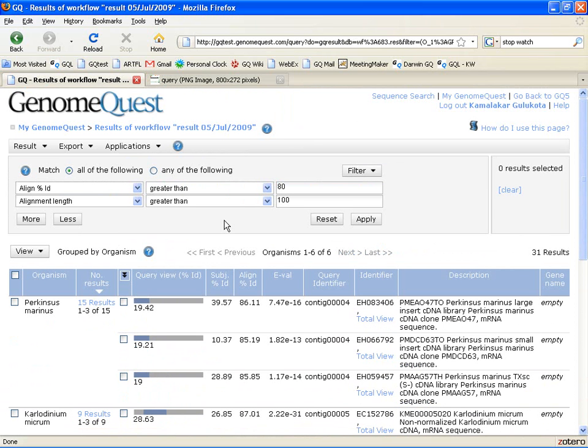So GenomeQuest allows you to mine your results by being able to filter those results or group them in a variety of ways.